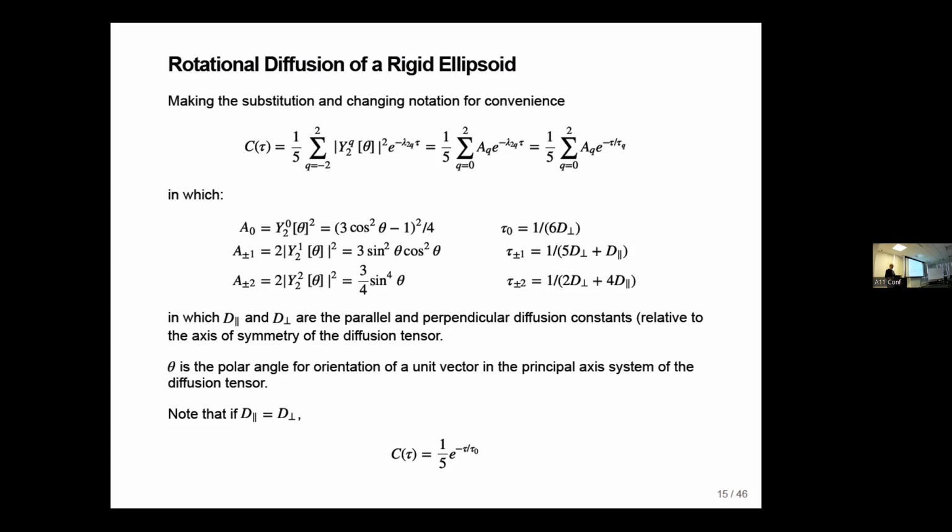So it stops working very well, for example, in a 4-helix bundle. In a 4-helix bundle where you have 4 helices pointing in the same direction, the NHs all point more or less in the same direction along the helix axis. So you don't have good coverage of the sphere in orientations.